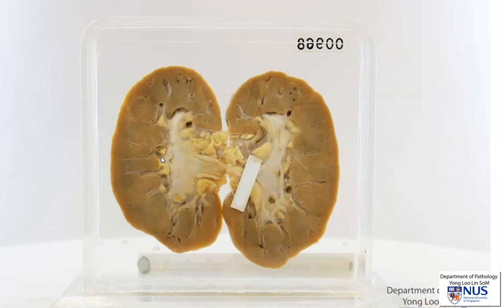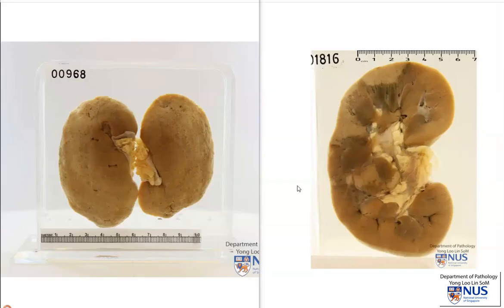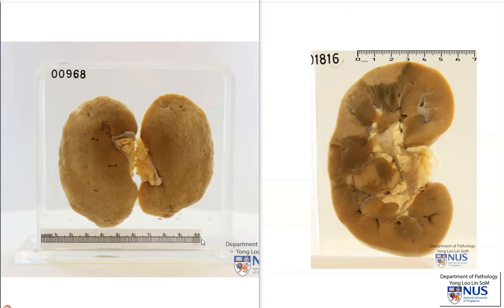So this is an example of an end-stage kidney. Let's compare this to another kidney. Here is a side-by-side comparison. This is not a normal kidney — it is a kidney showing the presence of renal infarcts. But the size is more or less normal, and I put the scale at roughly similar sizes. You can see the stark difference in size. End-stage kidney is usually small and shrunken.